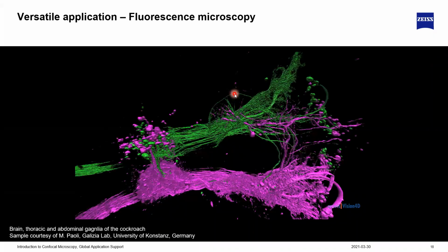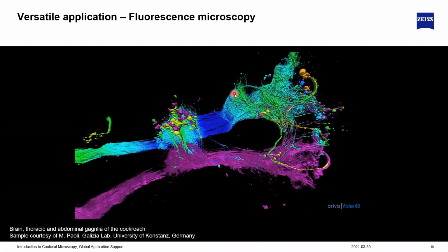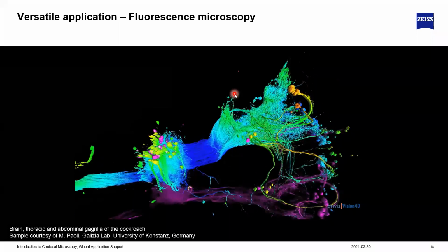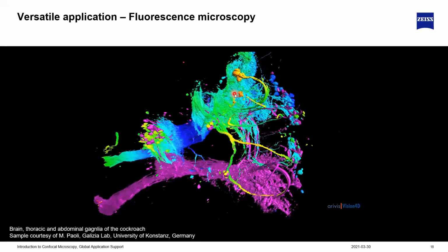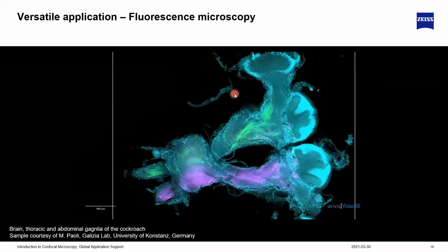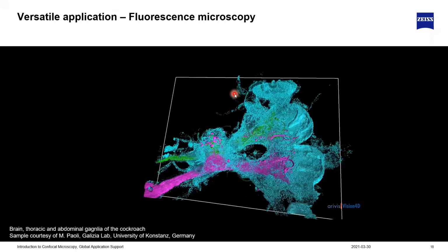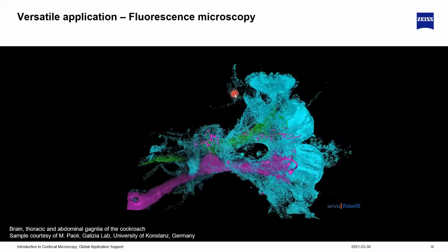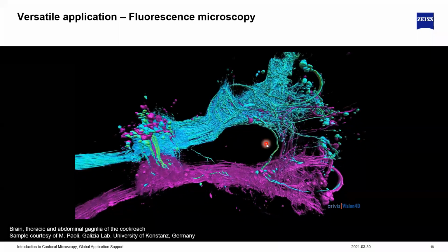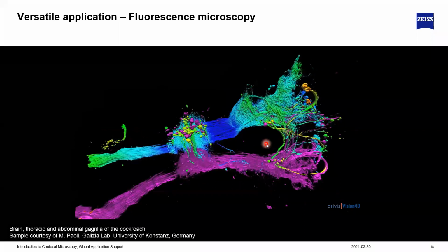So all these nice images, when we talk about nice images, most of the time people mean, oh, they're nice and colorful. So the confocal microscopes are probably the most dominant systems used in the labs today. And one of the ways how you can produce these nice images, if we call it nice images, is fluorescent labeling.